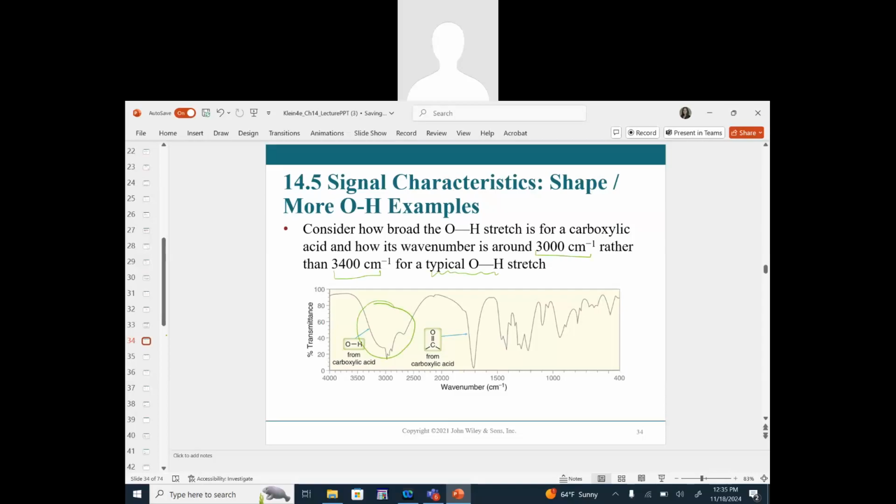And remember, a carboxylic acid has a carbonyl as well as the OH group. So we saw this OH stretch. We can also have a signal of our carbonyl, and that's what's shown in this region here. We can see that's around 1,700 or so. So we're going to see CO stretches in this range here, and for this example it would be with a carboxylic acid. And we're also going to see OH stretches for both carboxylic acids and alcohols in this region more to the left.